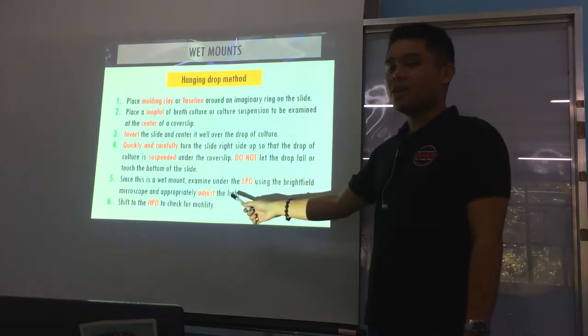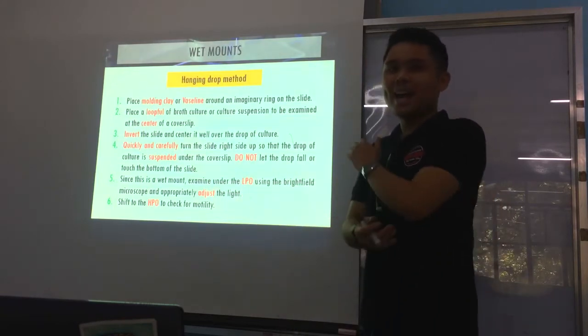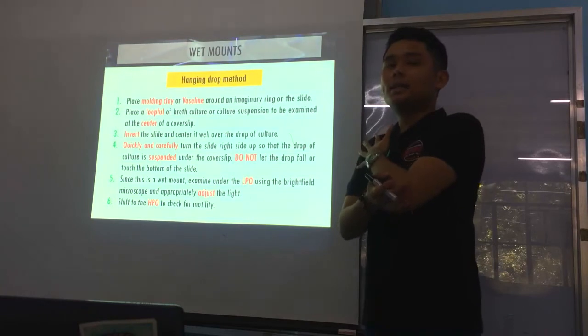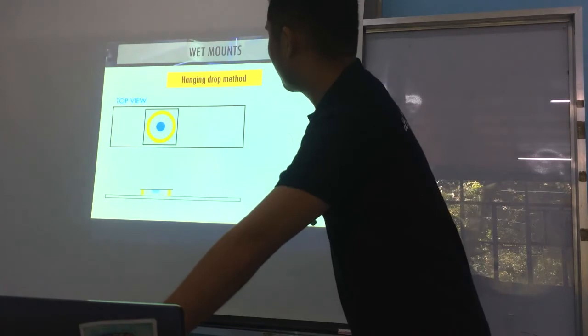Okay? First examine under LPO and adjust the light, and then to determine motility, use HPO. So this is the hanging drop method.